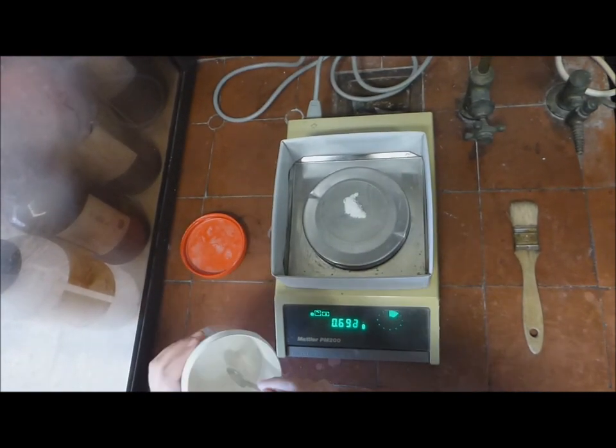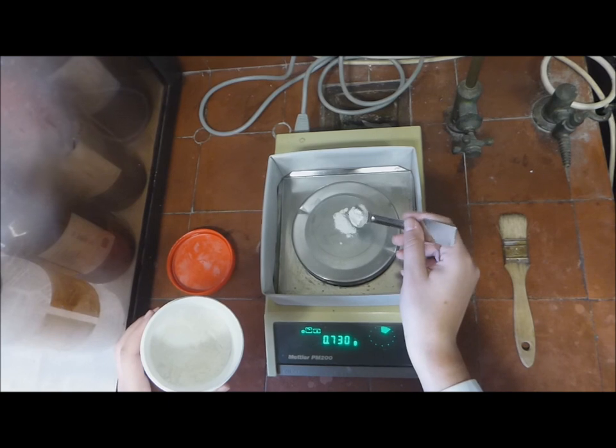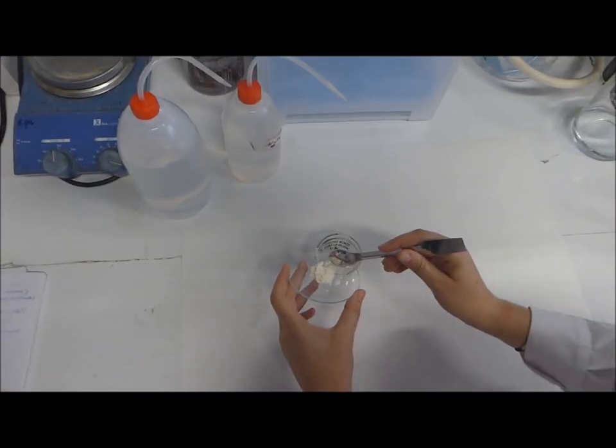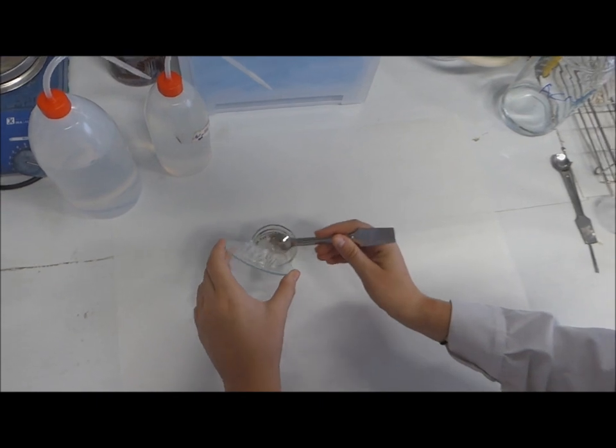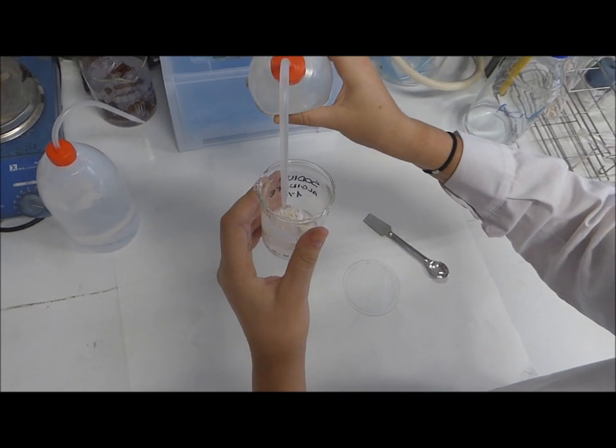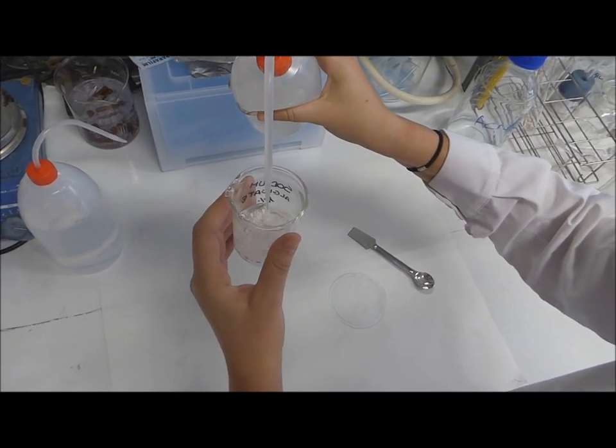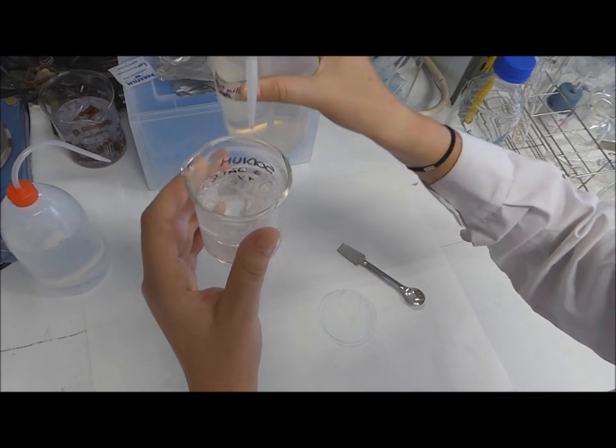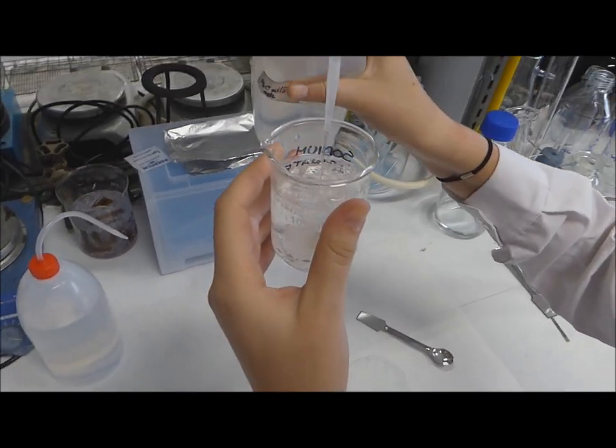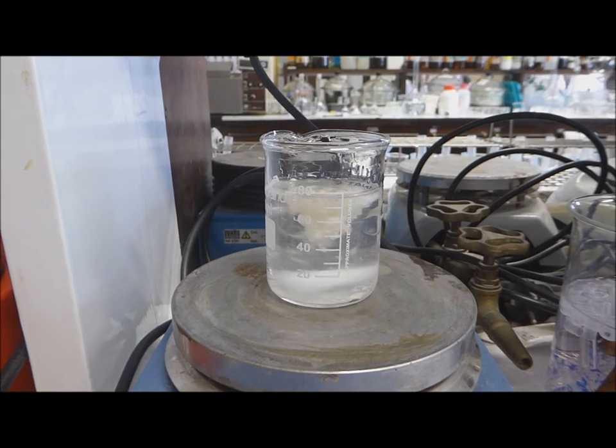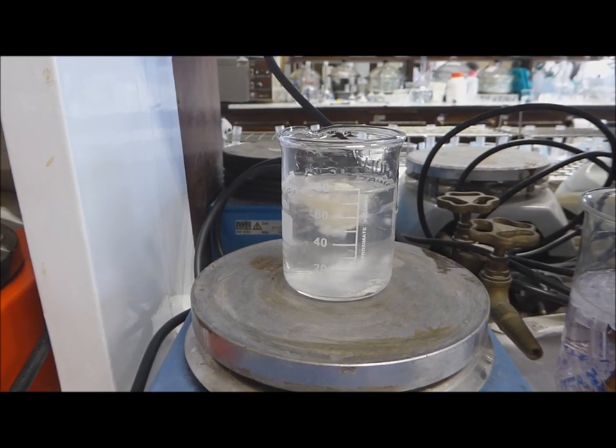We have to weigh one gram of sodium alginate in a tumbler of 100 milliliters. Next we add distilled water until 100 milliliters. We use a magnetic agitator to get a complete dissolution.